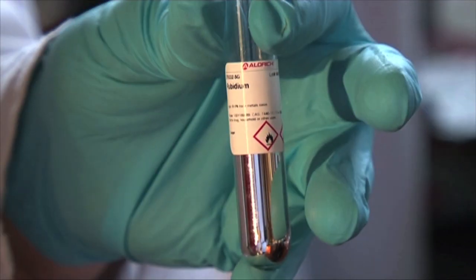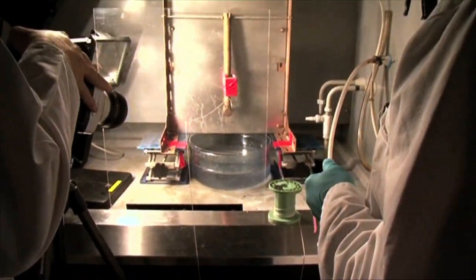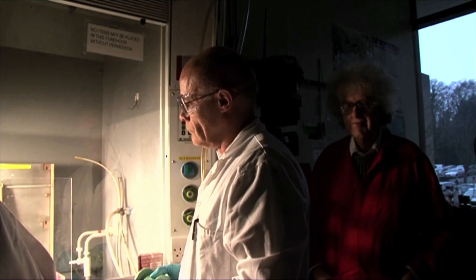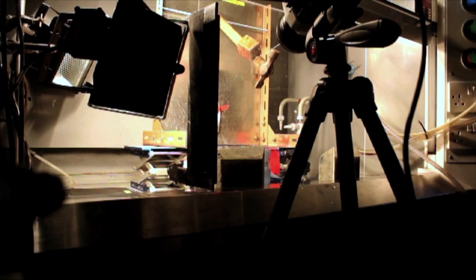So now we're going to show you rubidium, and in this experiment we put phenolphthalein, an indicator, into the water, which has the advantage that it's colourless in mildly acidic water, and pink if the water changes.